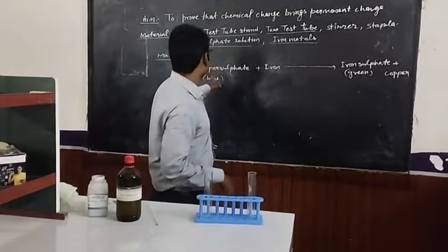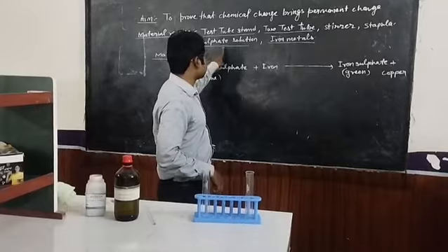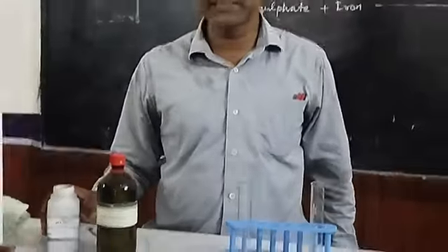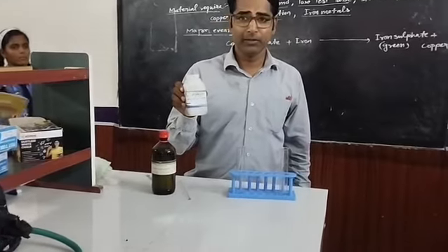Another thing that is required, we need a copper sulfate solution. This is the solution of copper sulfate, and another thing that is required is iron. Okay.